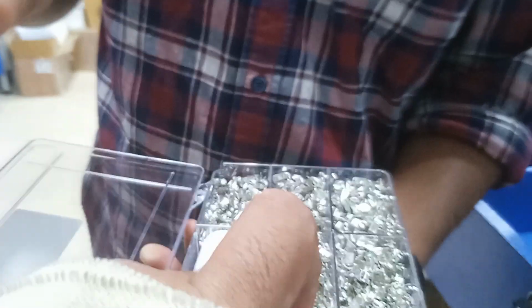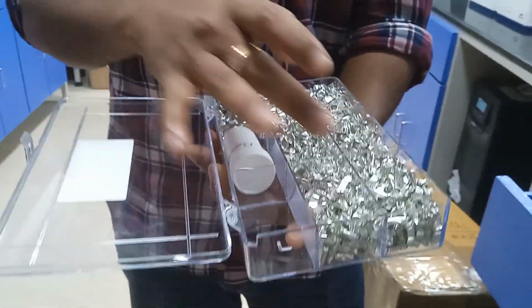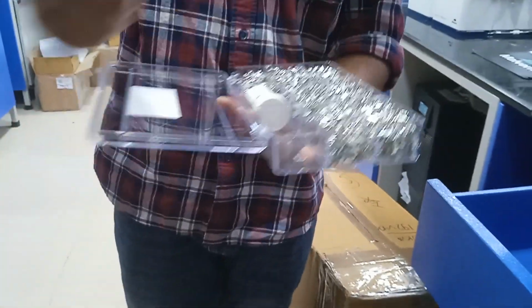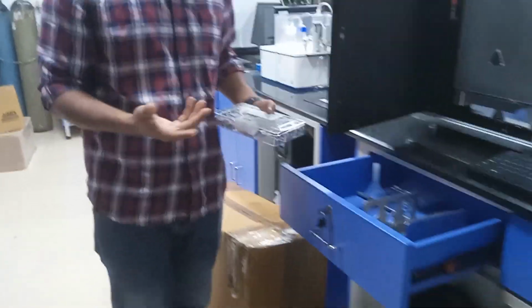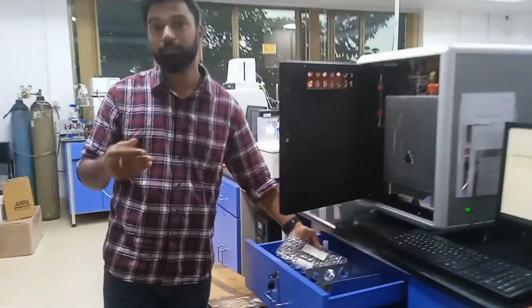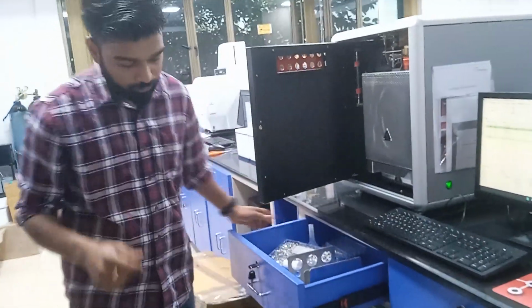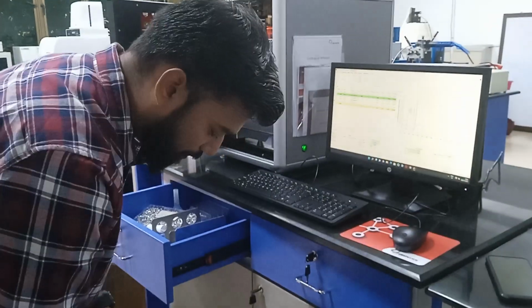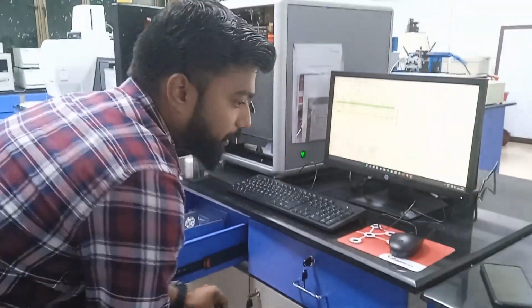For convenience, they have given a mold of this shape, so you can easily put and pour the sample. We even have multiple forms of packing material. For liquids, we use capsules. Can you show me one? I'm sorry, I haven't taken it yet. In that it will be very convenient.